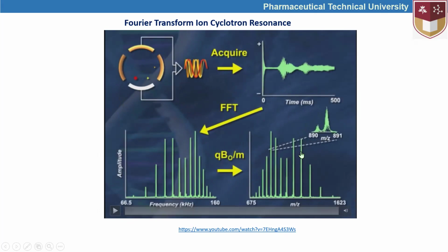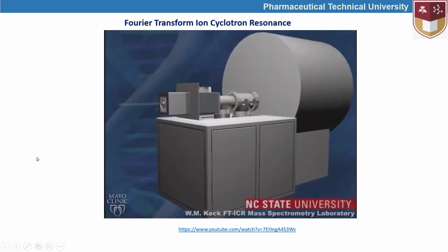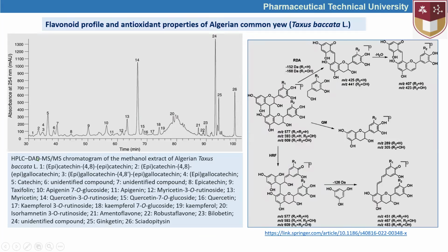So based on the oscillation, this amplitude and frequency related data is obtained and converted into mass to charge data. So this is how this tool works and results are obtained.